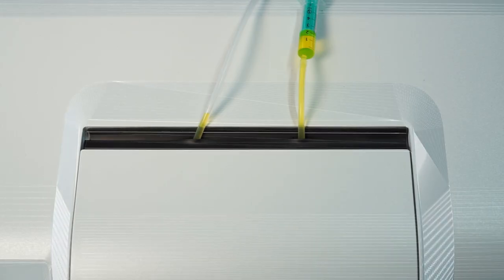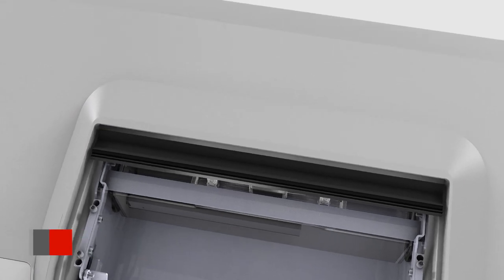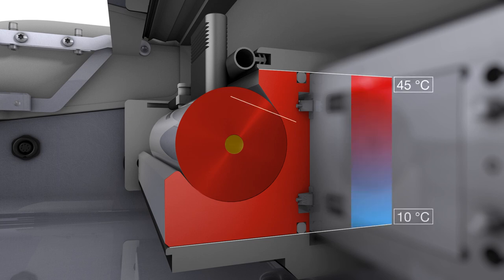As temperature is the most influencing external factor when measuring the optical rotation, MCP polarimeters are equipped with precise and fast temperature control. The cross-section shows that the sample cell is widely surrounded by a metal Peltier jacket, to provide a fast and homogenous temperature distribution of the cell and the product inside.